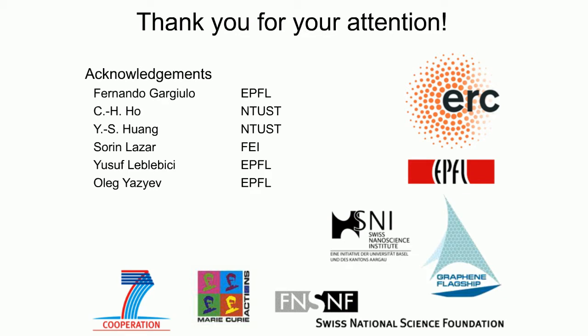We've done that a lot with calcium. What is it? I can't even remember. I do it a million times and still can't remember. But we do it with various materials. We've got a bunch of them in our brochures. But yeah, I would say in that order: STM, lateral, and then small amplitude tapping in fluid.